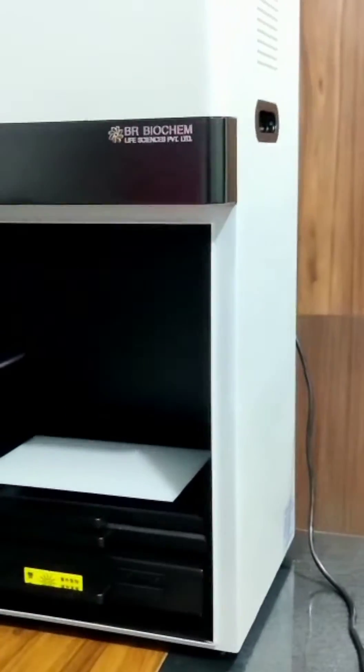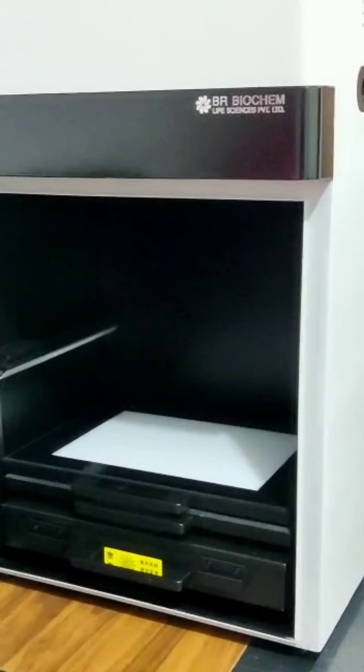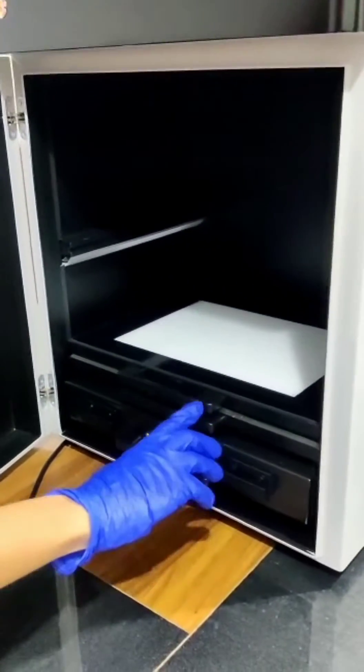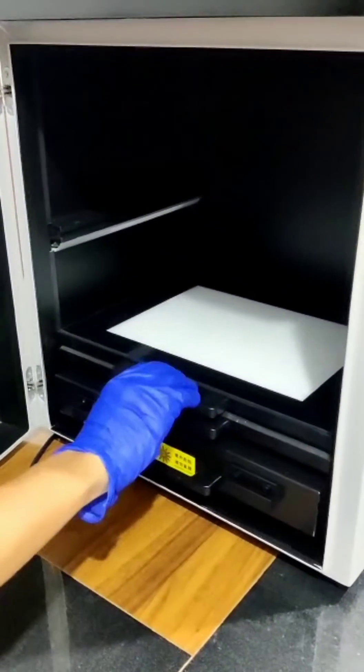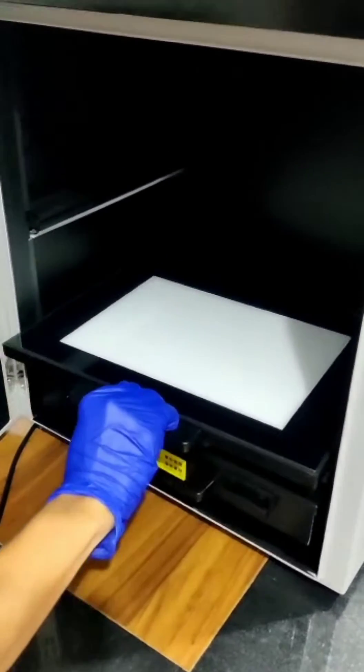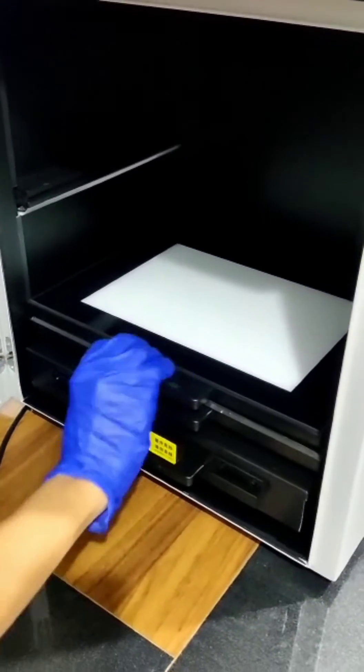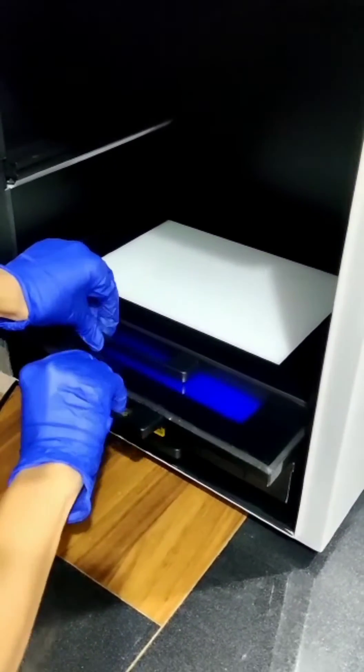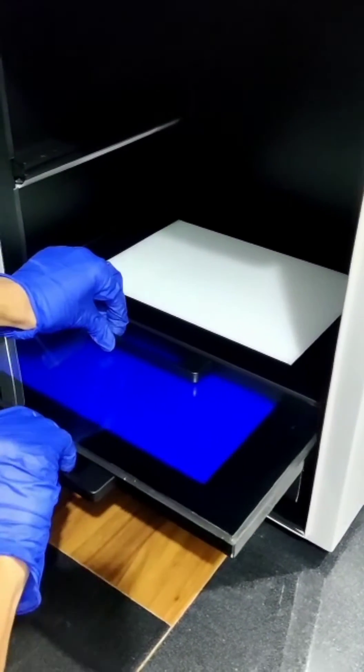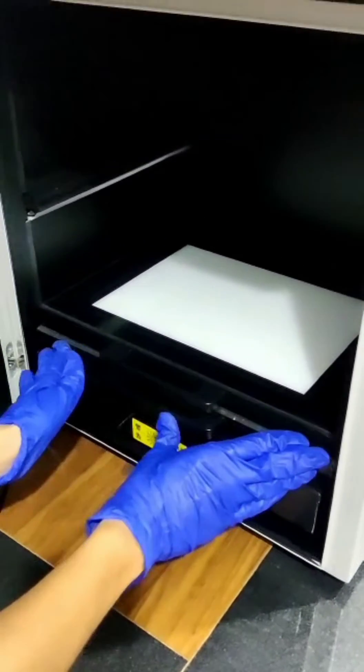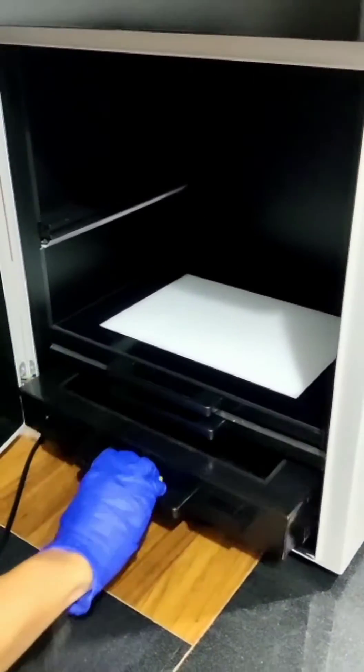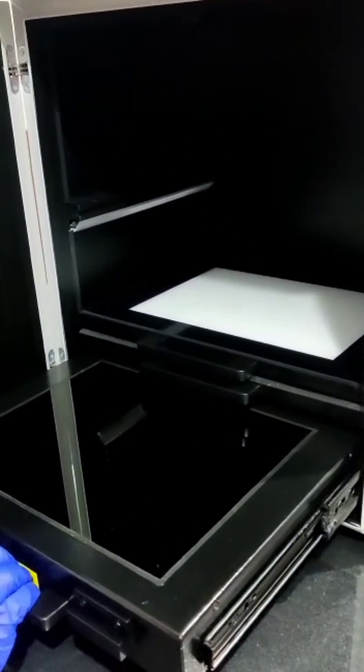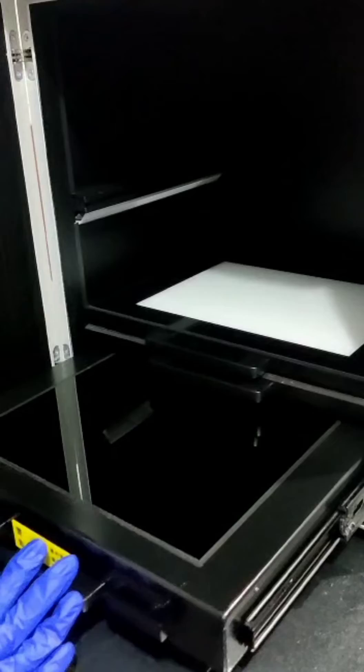In this system we provide 3 trays. One is white light LED tray, one is blue light LED tray, and one is UV Transluminator of 302 nanometer.